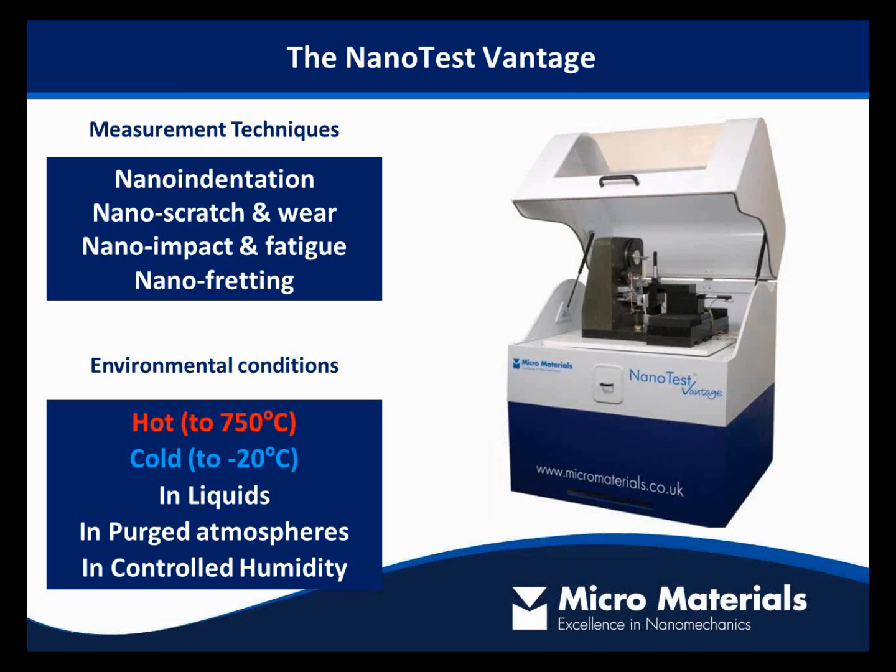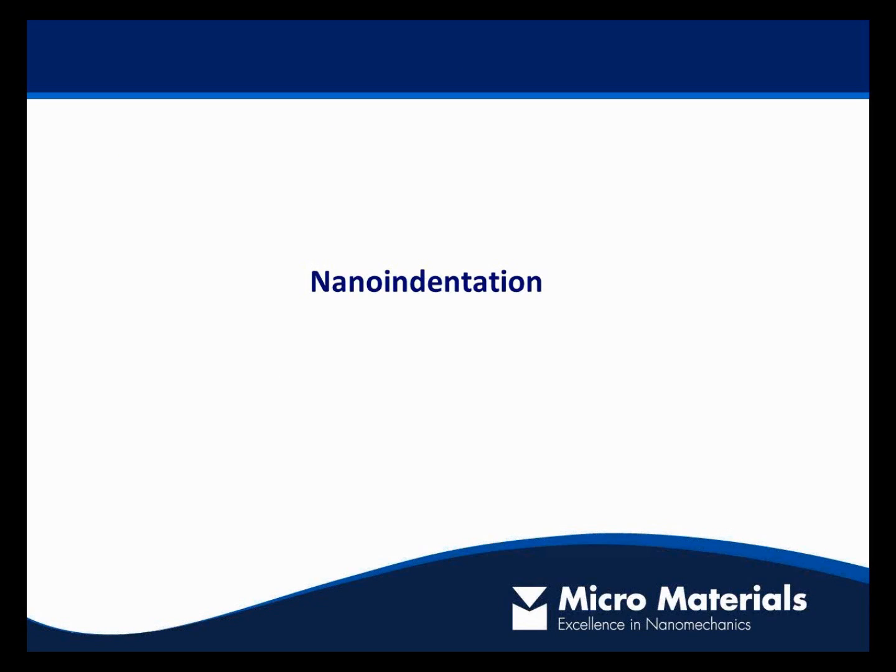We can perform in controlled moisture, either fully immersed in various liquids for biomedical applications, or we can change the humidity for different other applications, or indeed we can look at the effects of different atmospheres on the testing and suppress oxidation of samples that way, which is particularly important for high temperature testing. Okay, so I'll start with nano-indentation.